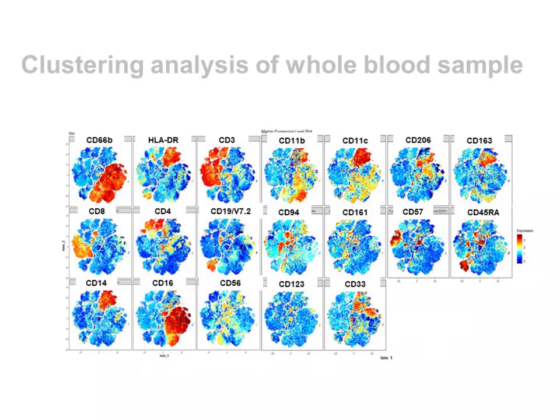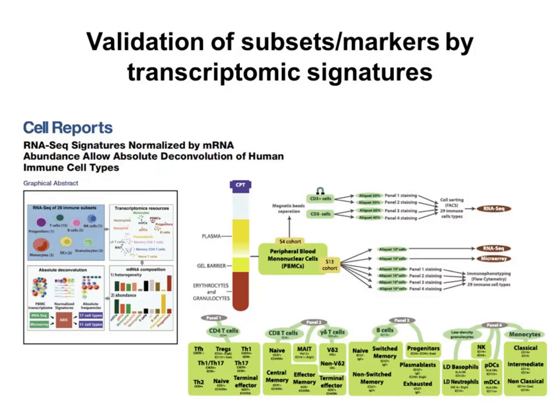The analysis of the markers that help us cluster the population is very important, because this enables you to better identify discriminating factors, while you also can identify which markers are maybe redundant. This is quite important because you can run high dimension flow, but to some extent you are limited by the number of antibodies and markers you can target. So the selection of markers is of course still very important in the design of the panel.